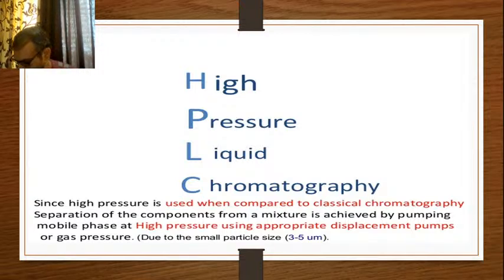Then there was another question about ultrasonification frequency. Ultrasonification frequency is any frequency that can stimulate vibrations inside the constituents. A frequency in between or just around 20 kilohertz can be efficient enough to produce degassing in case of ultrasonification.